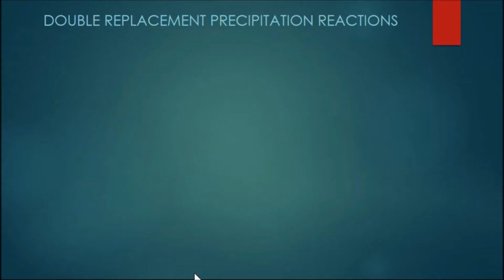This series of demonstrations is going to allow you to practice these double replacement precipitation reactions. So I encourage you to stop the video and try these for yourselves and then look at how I work them out. In this series of demonstrations, we're going to look at double replacement precipitation reactions. Now, they all have the same thing in common.